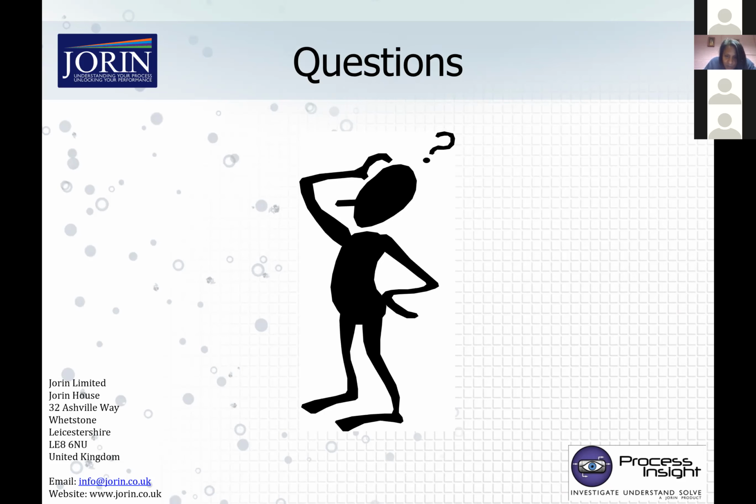So then we've got another question about turbidity. How does it handle high TDS? Okay, in terms of TDS, because it's dissolved, we're not going to see it. So high TDS actually doesn't affect ViPA at all.